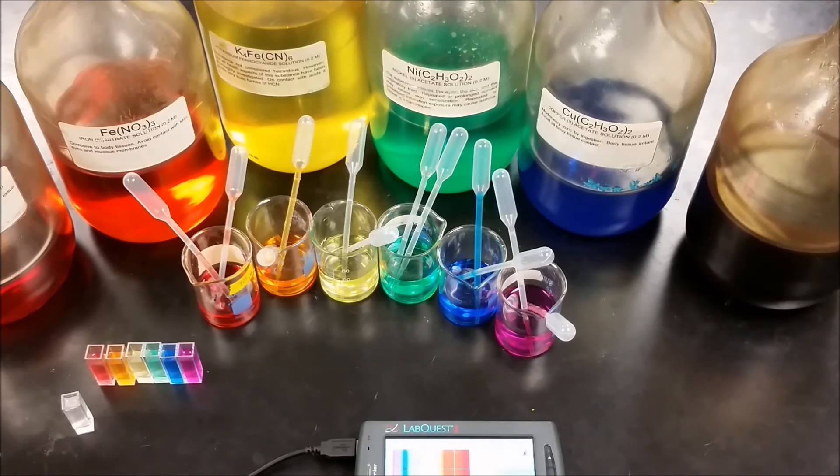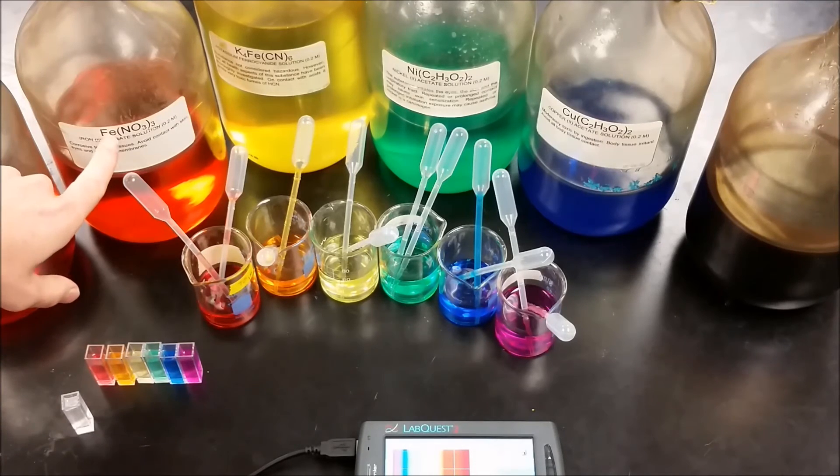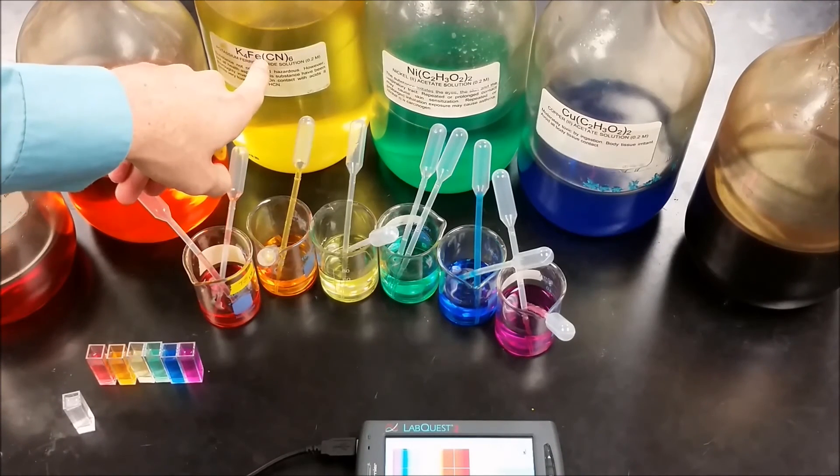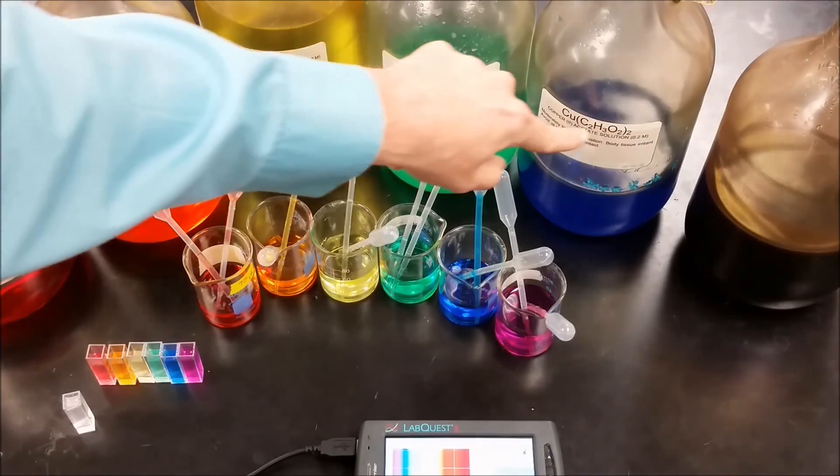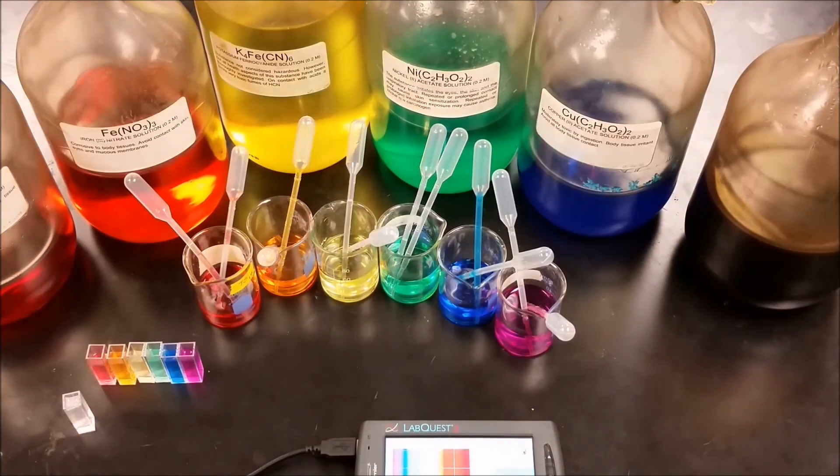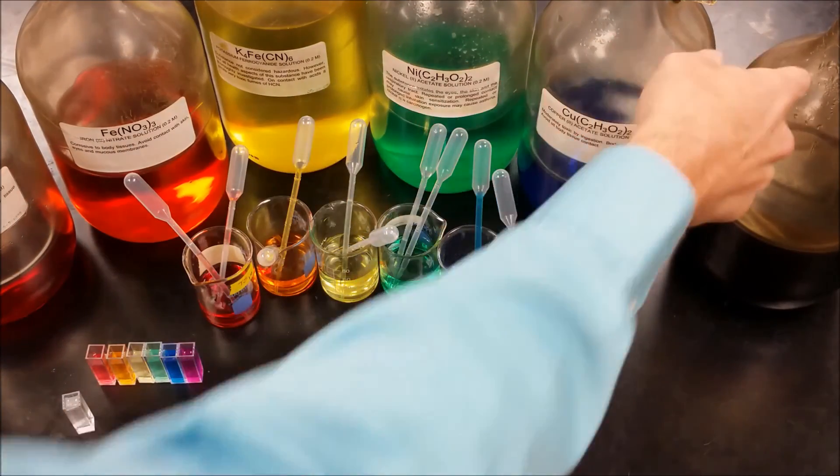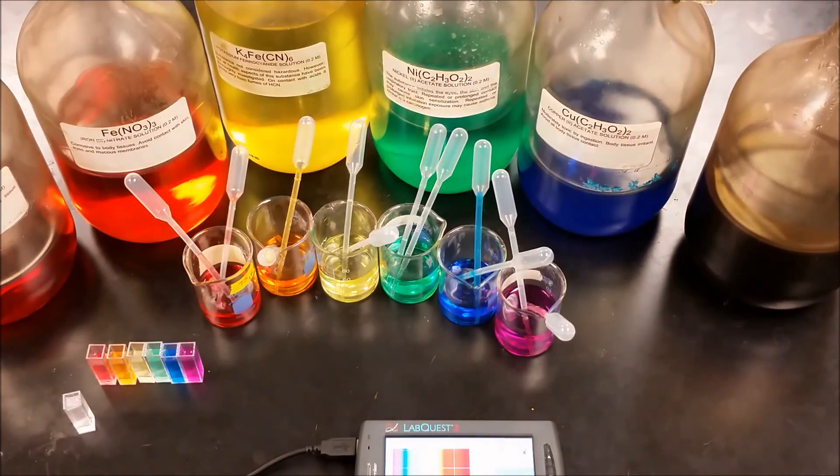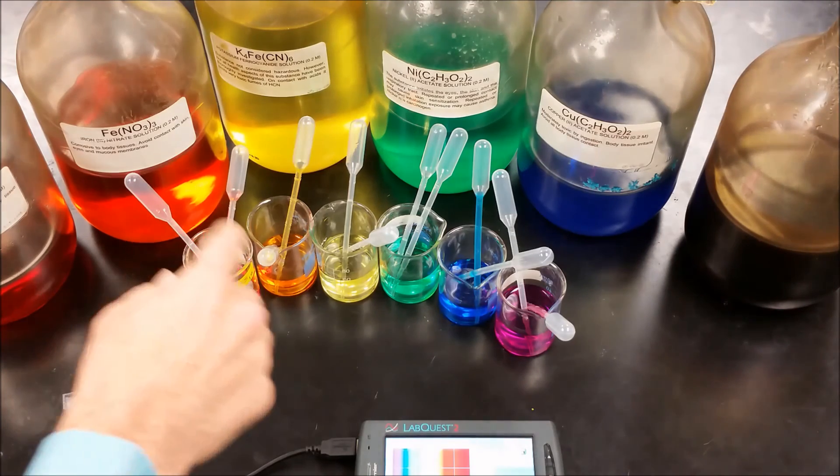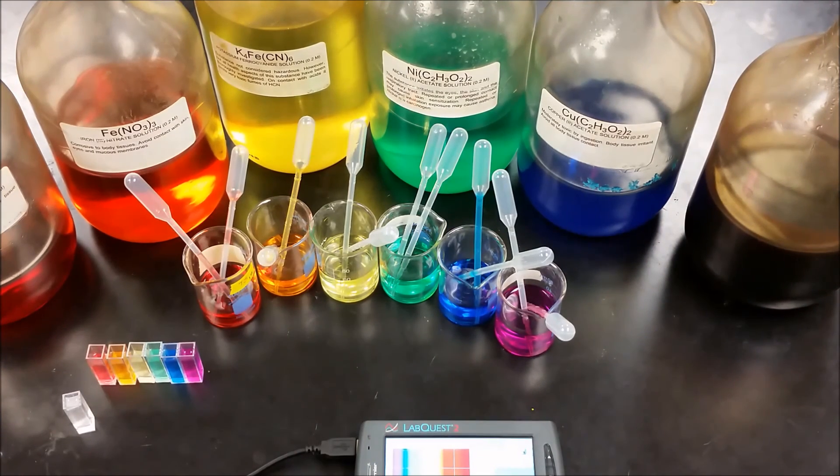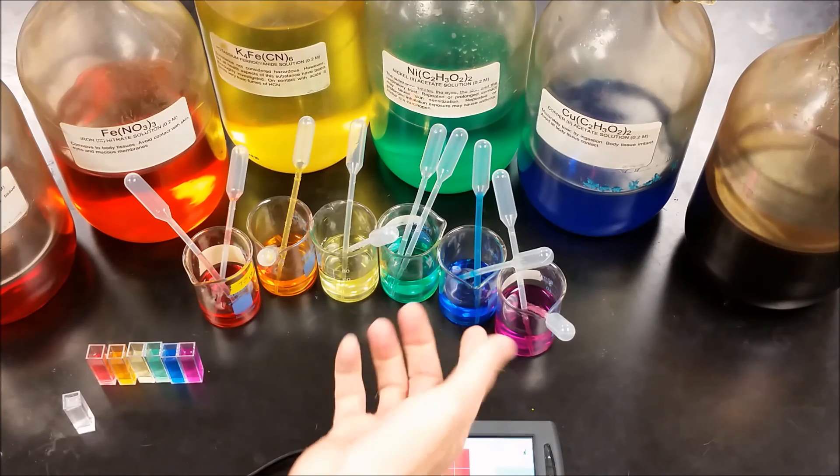These solutions are cobalt nitrate, iron 3 nitrate, potassium ferrocyanide, nickel acetate, copper 2 acetate, and potassium permanganate. So we're looking at cobalt, iron, iron, nickel, copper, and manganese. What do all of those have in common that allows them to have these particular colors? And additionally, what's going on electronically that's causing these particular colors of light to be seen by us? What's going on in this machine in terms of what's being seen and what's being absorbed?